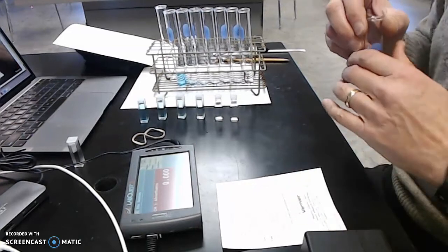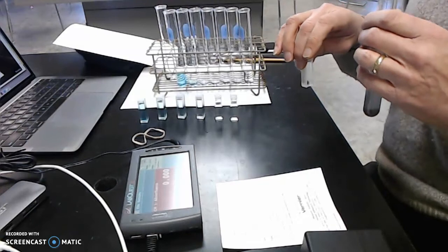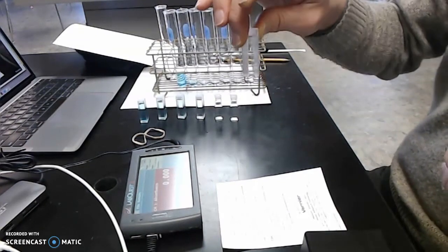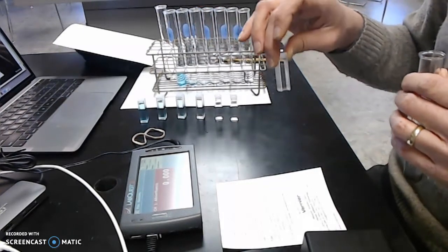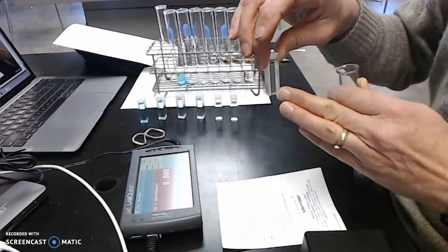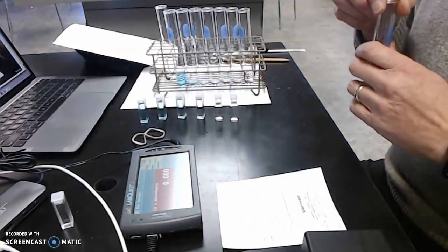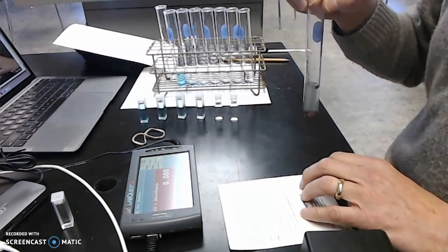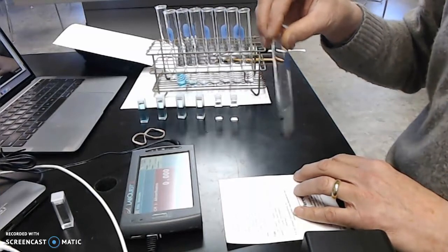Okay, guess what? The data that I gave you, the 0.594 and the 0.227, were invalid because of my calibration with the distilled water. There were smudges along the outside because I was not handling it correctly, and I had to recalibrate it. I will give you the numbers in a data table that you'll be able to use to make the graph. And so I'll just give you the link to that.